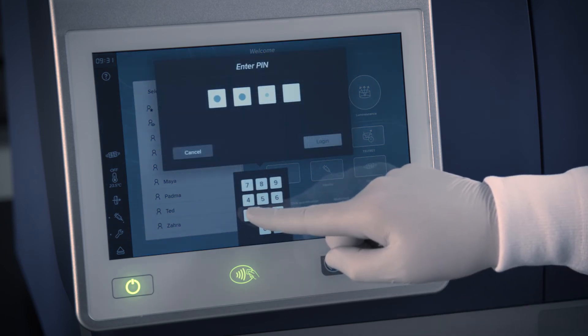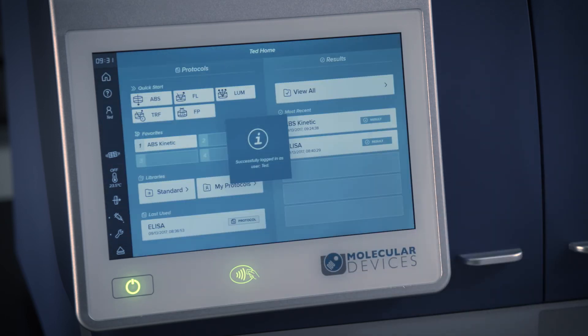For labs with many users, the user list will scroll vertically. There is no limit to the number of users you can create.